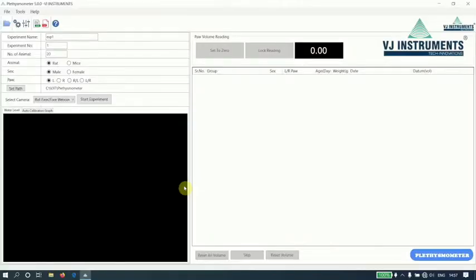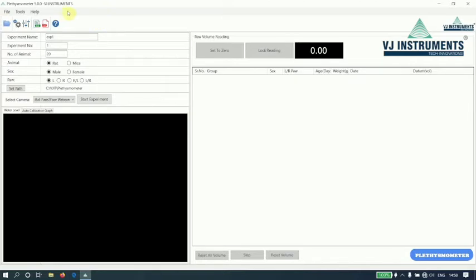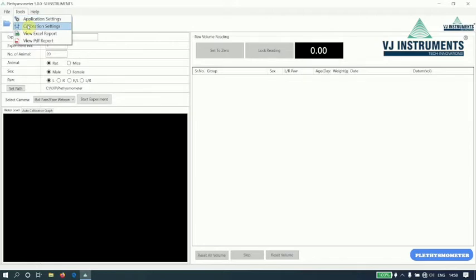This is the main window of the application. It has a menu bar and toolbar. We have options like application settings, calibration settings, and options to view the reports.